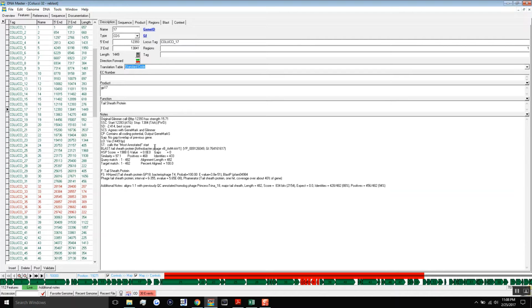So once you submit it, anyone will be able to download this file, look in your gene notes, and they'll be able to tell what you named the protein functions, and where you got that information from, etc. They'll be able to see all your complete notes and everything like that, which is awesome. So that's one of the files that you'll have to create upon submission.